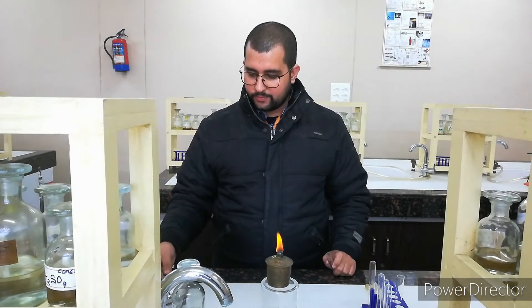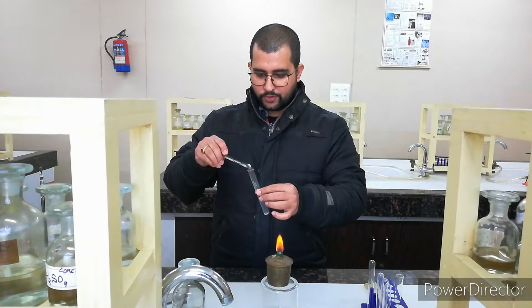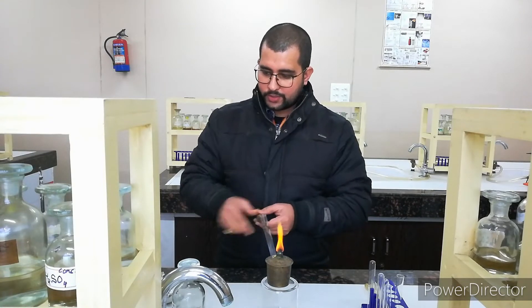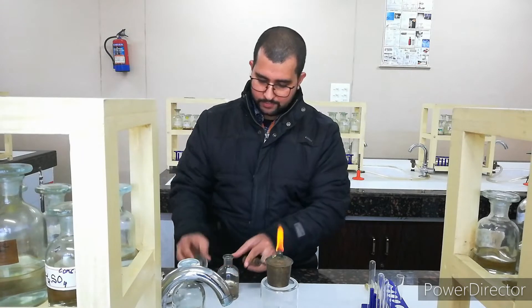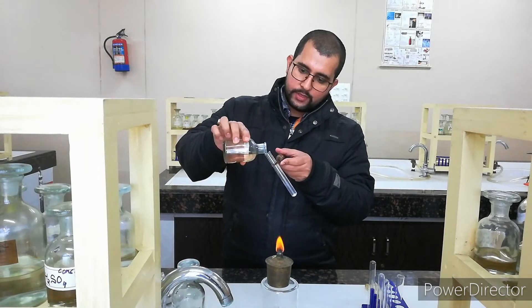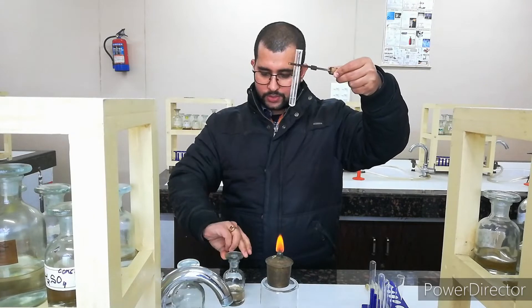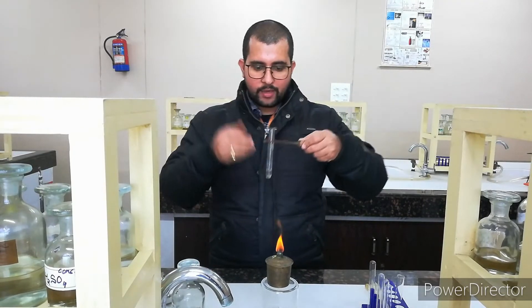Now we are doing the examination with concentrated H₂SO₄. I have taken again a small sample and I am using a test tube holder because we are handling the concentrated H₂SO₄ — just be careful, it is dangerous. I am adding a little bit of concentrated H₂SO₄ and we will observe if something happens or not. No gas is evolving and no smell is coming.